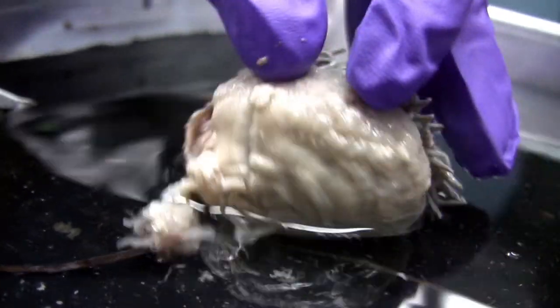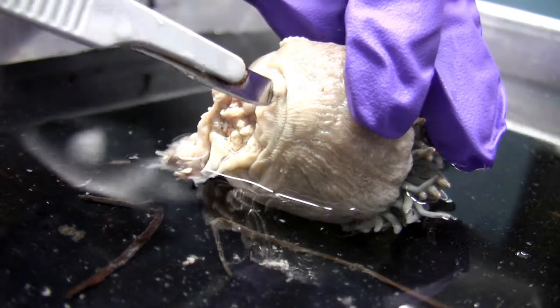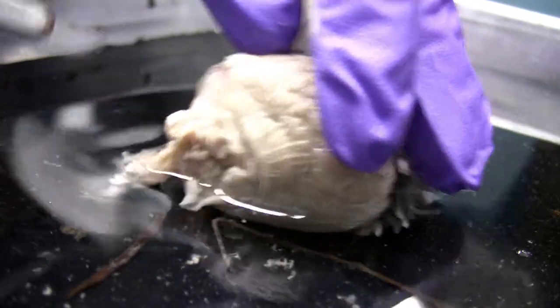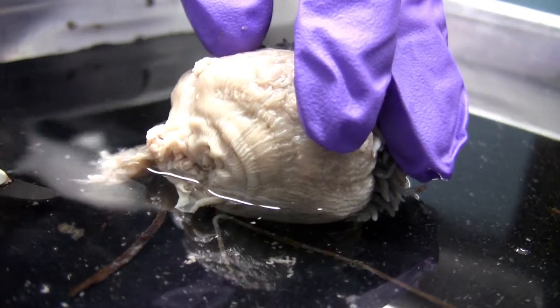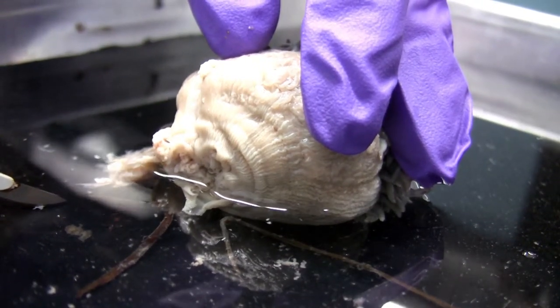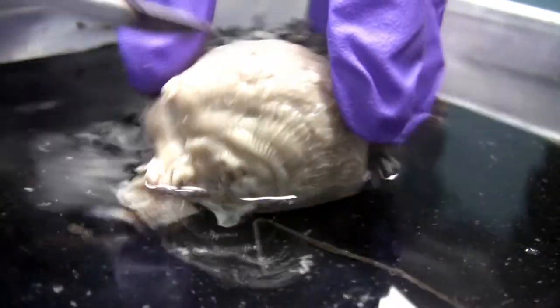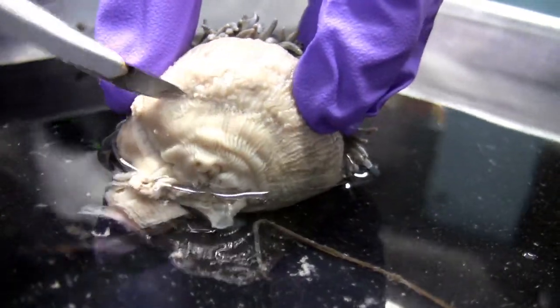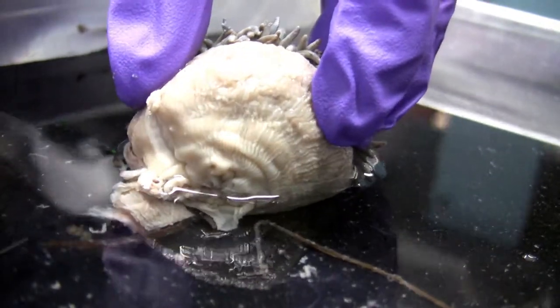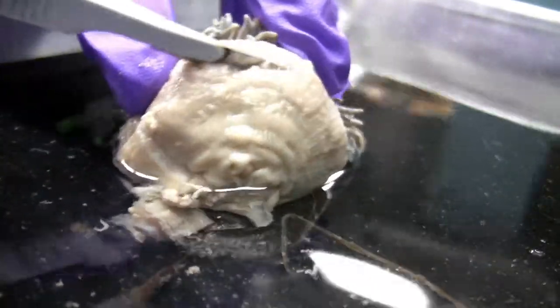Okay, she's right at the bottom? It says here... So that's supposed to: section specimens horizontally at several places between oral and pedal discs and observe mesenterial arrangements. And the positions of the well-defined tissues such as retractor, musculature, and the gonads. So I guess just slice this thing in half. Okay, here goes nothing.